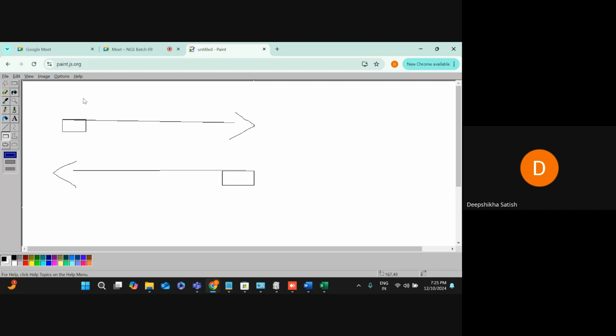Then the sequencing machine starts reading, and for this forward strand you get the forward file here. And this is my reverse strand. If the adapters are ligated at the reverse end, the sequencing machine will again read and give you the reverse file. So you will get either the forward or the reverse file, depending on the data.